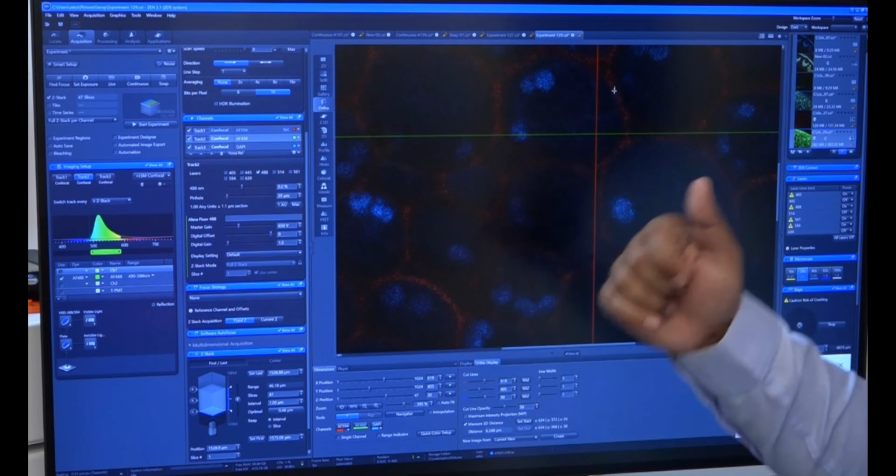And if you want to have a 2.5D, which will give an impression of how much it is raised from the flatness, as you can see for the red and green, you can see the distribution here. For the blue, sorry, you can see the distribution here, and then you can move around in different Z positions to see for different channels.